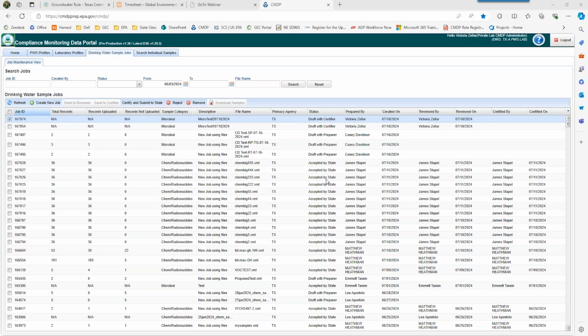Okay. Someone asked, what happens if someone grabs your samples? I'm not sure why someone would grab your samples. If you're a lab and you're entering samples, the only people who can see them are people that the lab has given permission to see those samples. I don't think anybody else could grab them unless they were at your lab. Okay, thank you, Rebecca. We already answered your question.